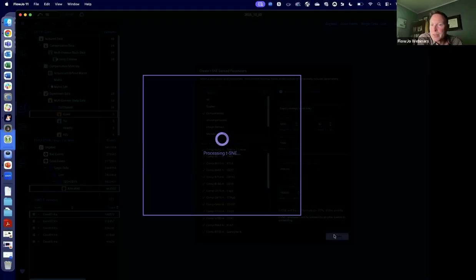Ooh, we are down to the last 5 minutes of this allocated webinar time. Come on, t-SNE, finish up. And then I will quickly show some charts and tables and reports. I have apparently taken my time talking through the program to this point.